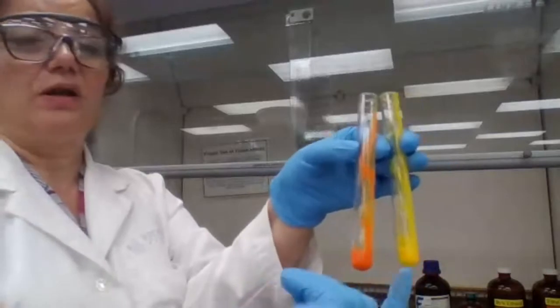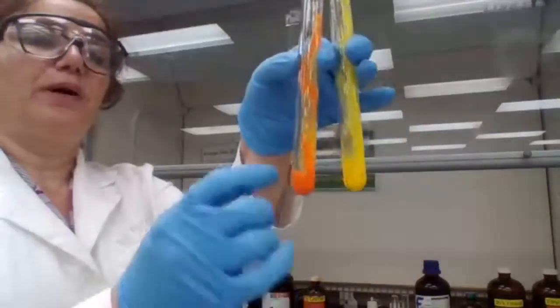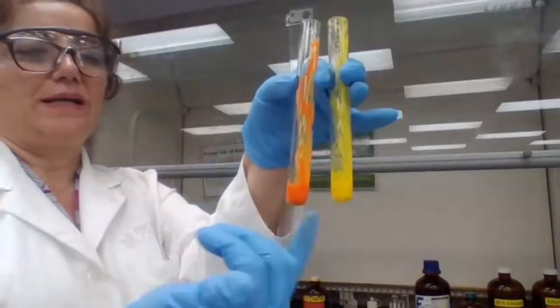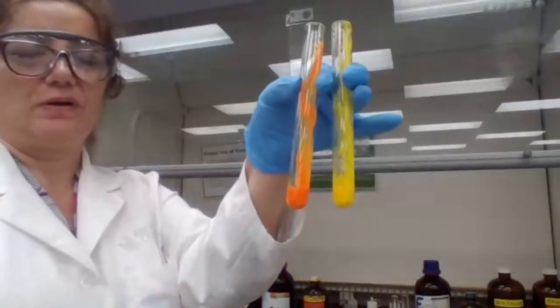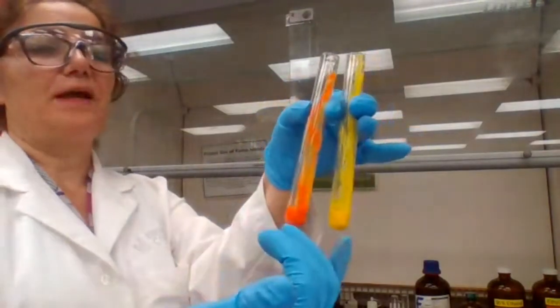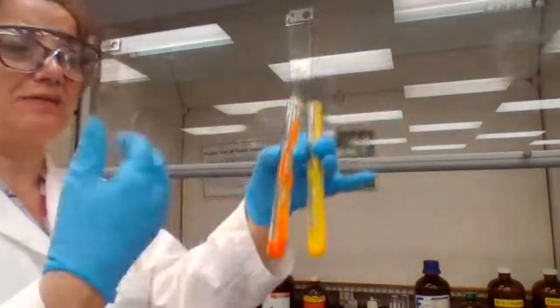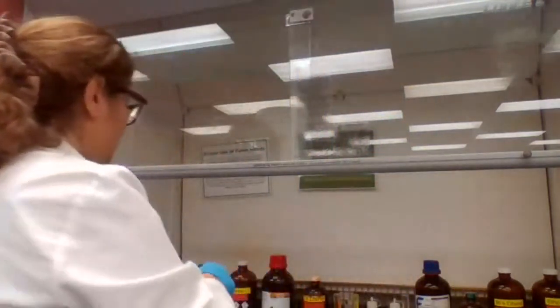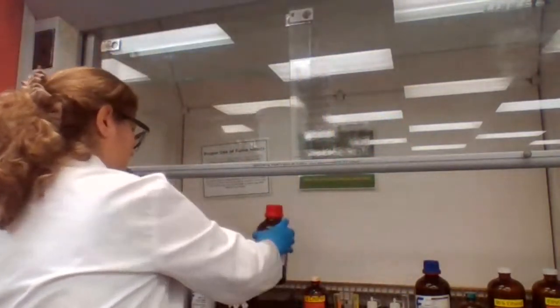The shade of the color is not exactly the same, but both of them produce precipitate. So I can use the precipitate for melting point later after I get it. And it's the evidence that the compound is either an aldehyde or a ketone. And one aldehyde.